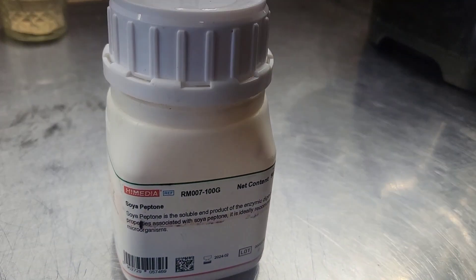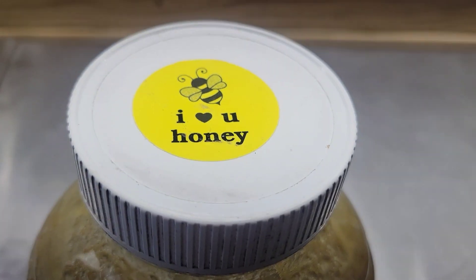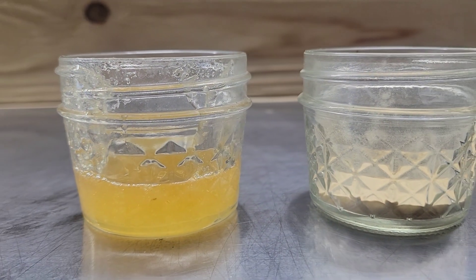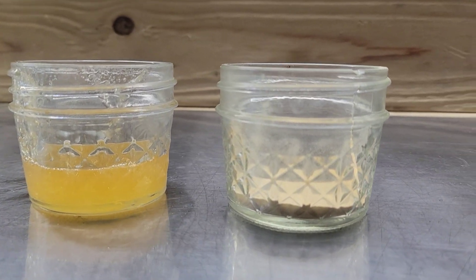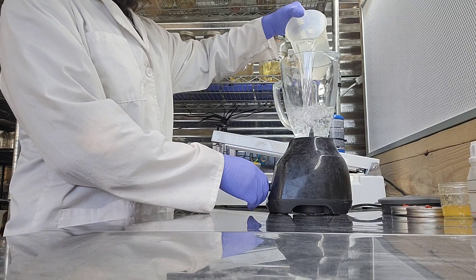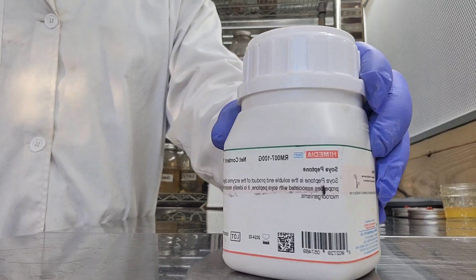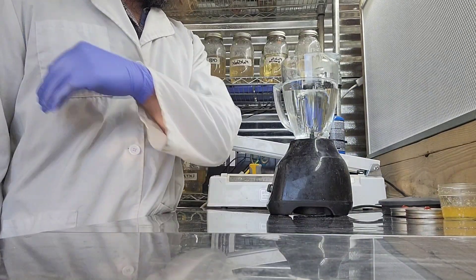The honey is the other main ingredient. We'll be using 40 grams of this local honey from Paonia today. I've got the 40 grams of honey weighed out, and I put two grams of that soya peptone in the other mason jar right there. Now we're going to take 1000 milliliters of water and put that in the blender as the first step.